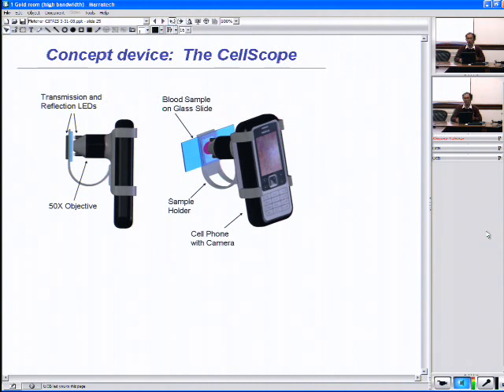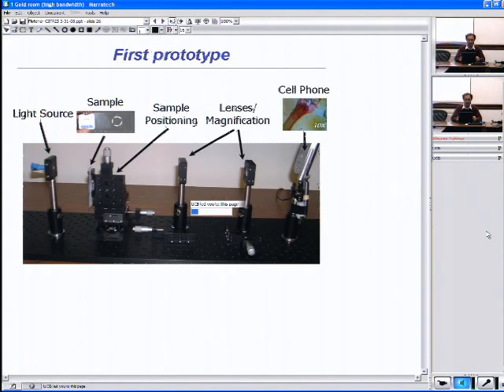So this is really our goal: a device in which attaching simply a plug-in to a particular phone will enable this kind of microscopy. To a large extent, this is going to be phone-specific, since the cameras are in different locations on different phones, but the concepts are quite similar: we need to be able to magnify and transmit that image into the CCD of the camera.